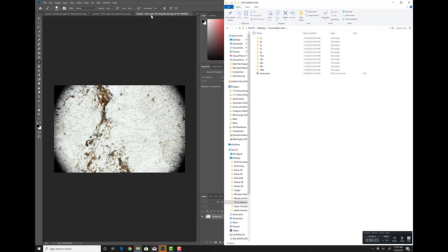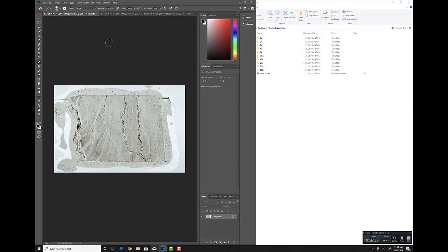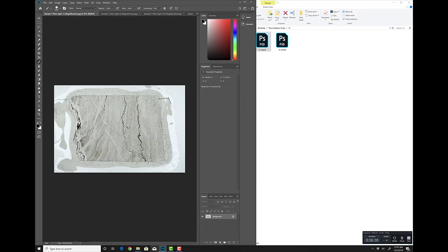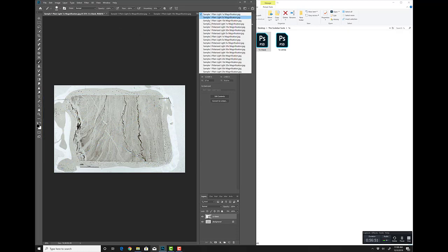Then what we're going to do is refer to the orientation and also select a color that gives us really nice contrast. Let's go to sample 1 and do the 1x magnification. We'll tag all of the 1x's, starting with the 1x black. You want to resize it so that the resolution is paired properly, and then you can move it anywhere you want. Press enter, and then we'll go down to the next 1x sample.